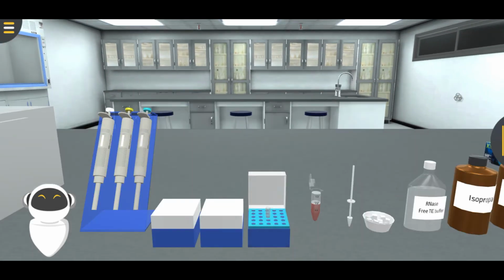That's done. I'm going to take a moment and talk about what happened until now. We added Trizol reagent. If you remember, I talked about the guanidinium thiocyanate. That's the denaturant, and what it does is precipitate DNA along with RNases and other proteins. So they're going to be in the lower layer, and RNA is going to be in the upper, aqueous layer, which is the colorless part. Later on, we added chloroform. The purpose of adding chloroform was to remove the fuzziness between these two layers.